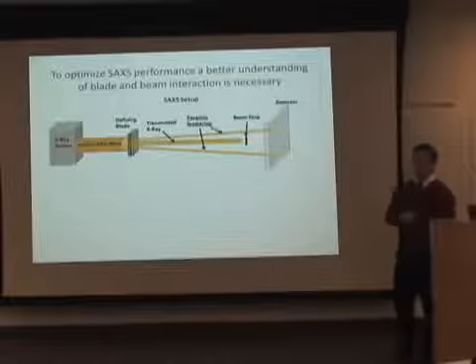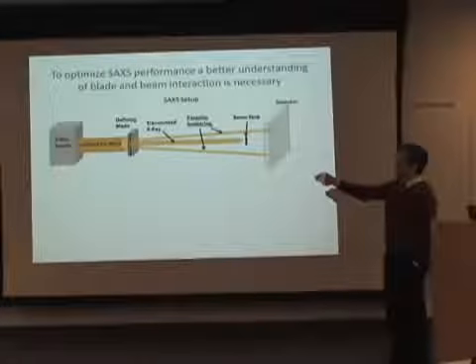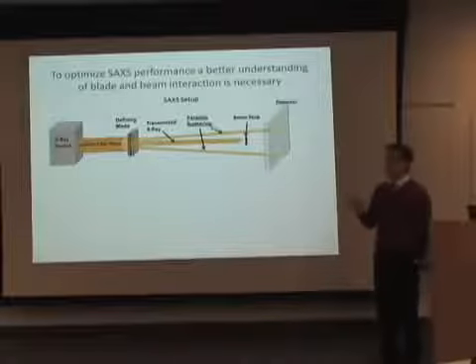And to optimize SAXS performance, we have to get a closer look at the interaction of the defining blade and the incident X-ray beam. Or in other words, what is physically happening at the instant the blade is interacting with the X-ray.